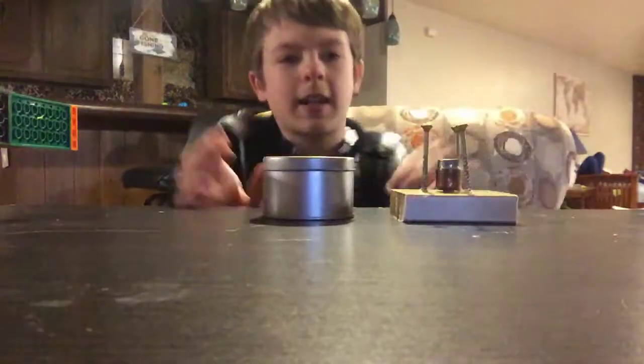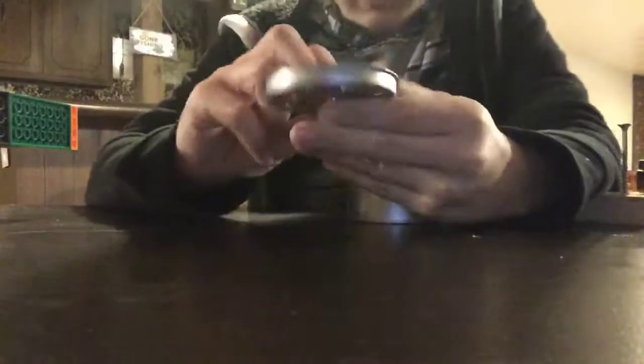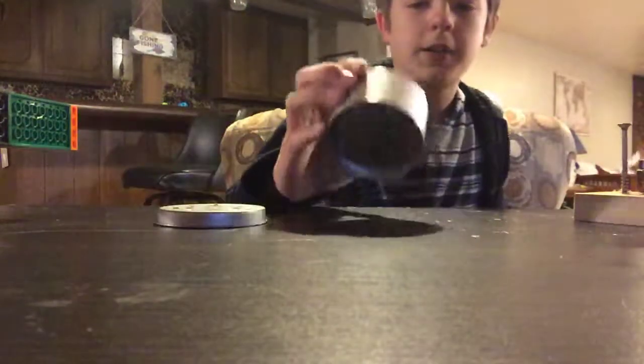I'm going to move my desk real quick so you can get a better view. There we go. Here are the two things that I built. Right here we have a little metal tin from some magnets that I bought — some EDC fidgeter magnets. They're sort of what's left of the top of the tin. And here's the bottom part of the tin.